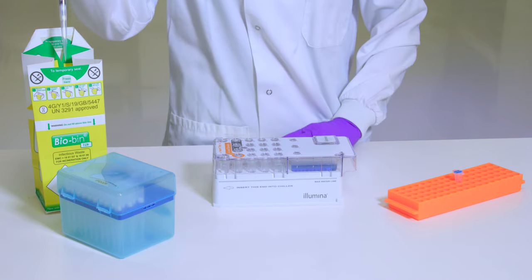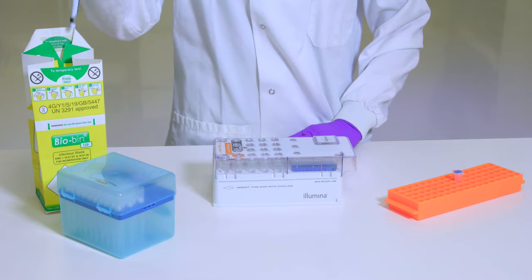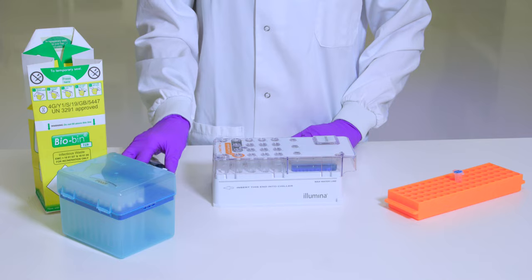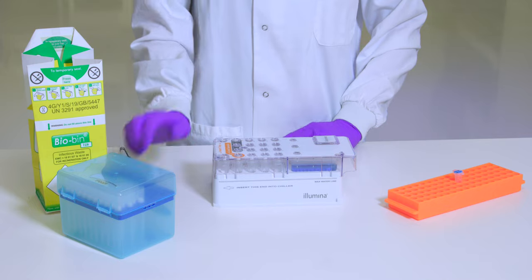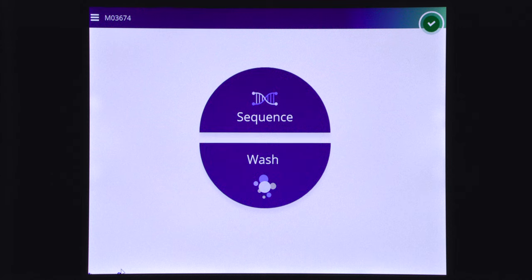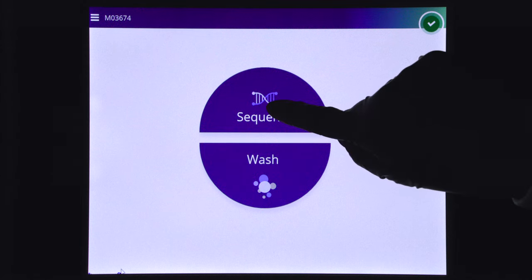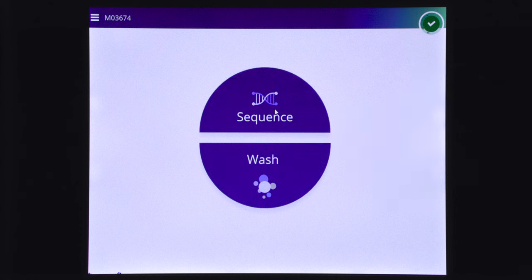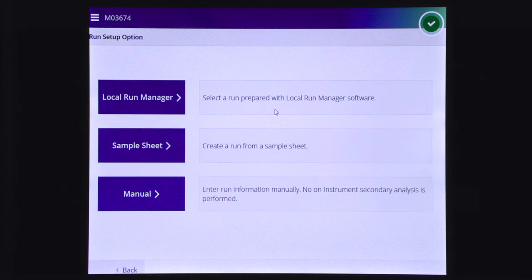Proceed directly to the run setup steps using the MySeq control software interface. To begin the run setup steps, select sequence from the home screen of the MySeq control software.